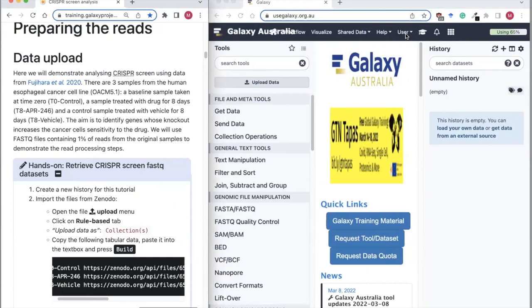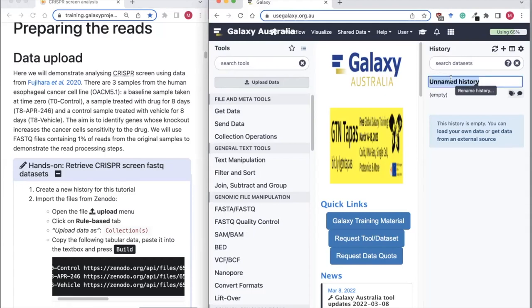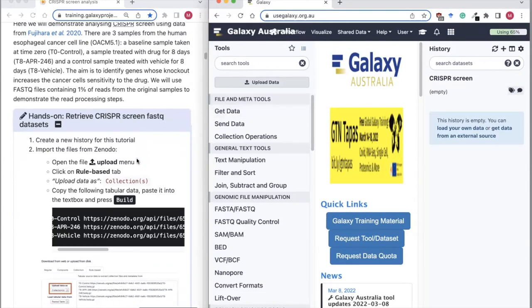Go ahead and log into Galaxy if you're not already logged in. Then in a new history, give it a name — I'm going to call it CRISPR screen. Then we will load in our data.